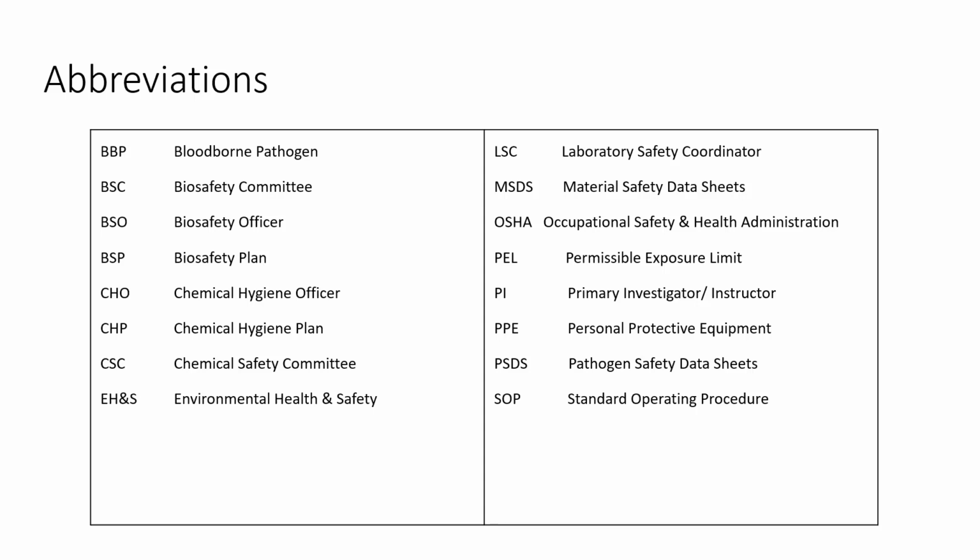Sometimes it's a research lab, sometimes it's going to be a clinical lab. We order in a lot of reference strains so that we can use them as positive or negative controls in different tests. We can also validate test systems using those reference strains. So they can be found there and also in classrooms. SOP is a standard operating procedure.